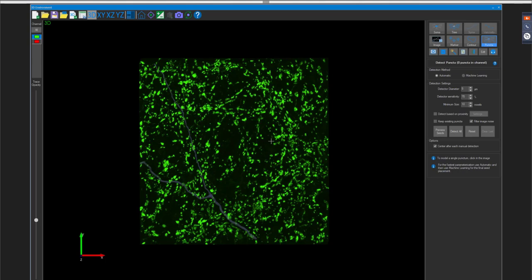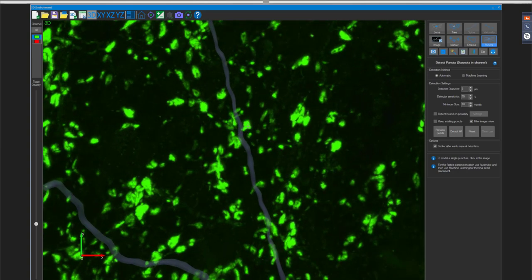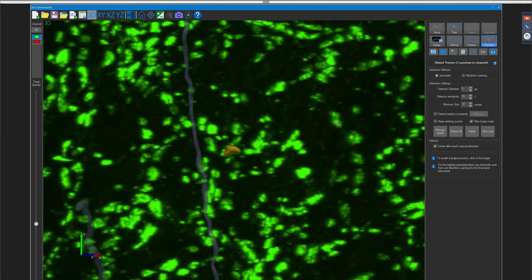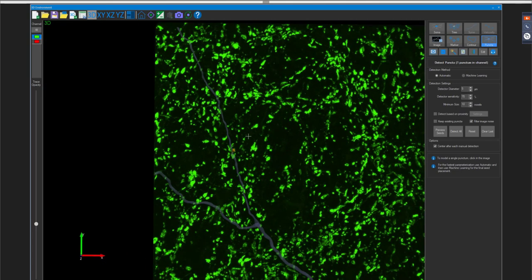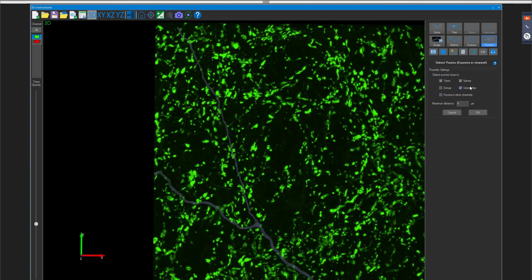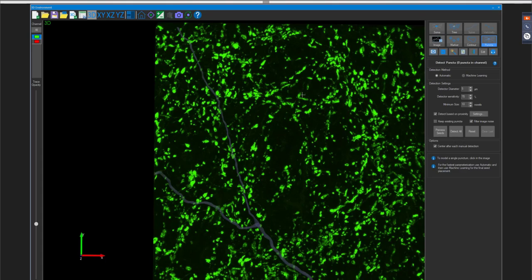This transparency ensures you can focus on detections within the current channel. For puncta detection: you can click on a single punctum to detect it, or click 'Detect All.' TJ opts to detect based on proximity to already-traced neurons. In the settings, you can detect puncta in proximity to trees, spines, somas, varicosities, or even other puncta. For this example, proximity is raised to 8 microns.